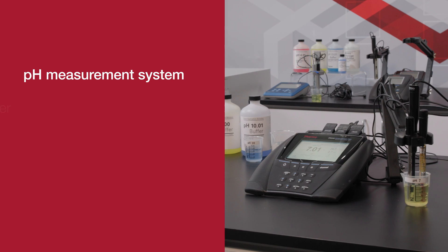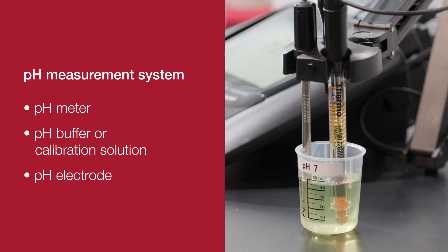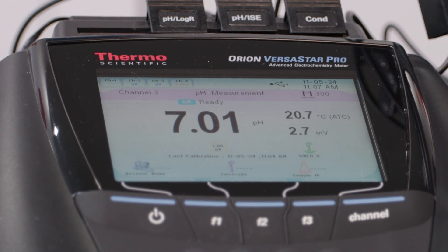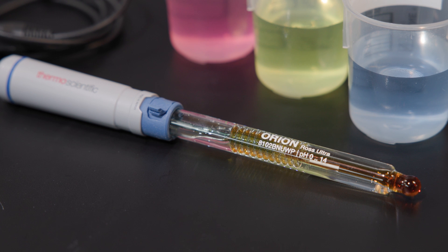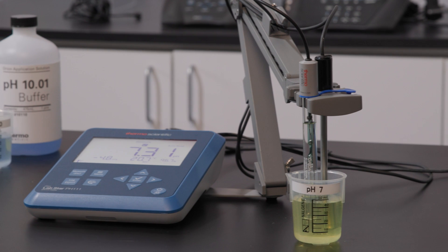A pH measurement requires a system that has three parts: a pH meter, a pH buffer or calibration solution, and a pH electrode. Not all users understand that the pH meter simply serves as a display and storage aid only. It's actually the pH electrode that conducts the sample analysis and is the most pivotal part of the entire pH system.